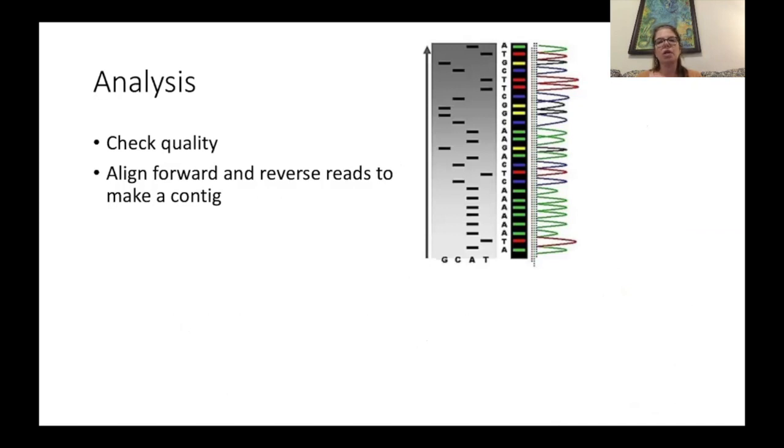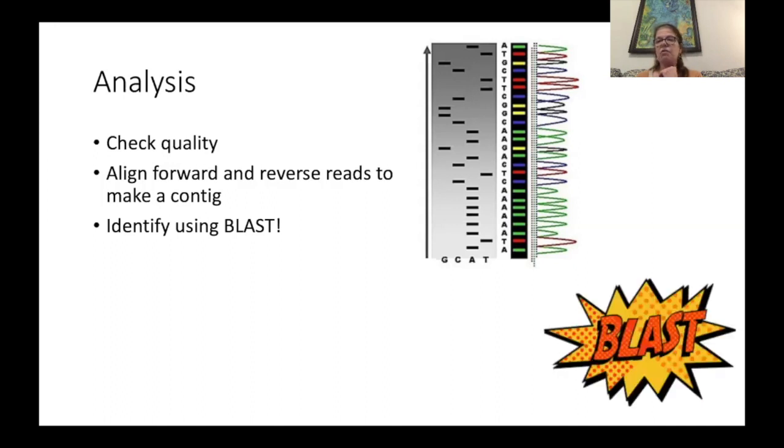And then you'll go in and analyze it using something called BLAST. BLAST is a centralized database, very, very large, maintained by the NCBI, of DNA sequences from you name it, from all kinds of different sources. In fact, when an investigator identifies a DNA sequence in a study, they are supposed to actually report that into the BLAST system.